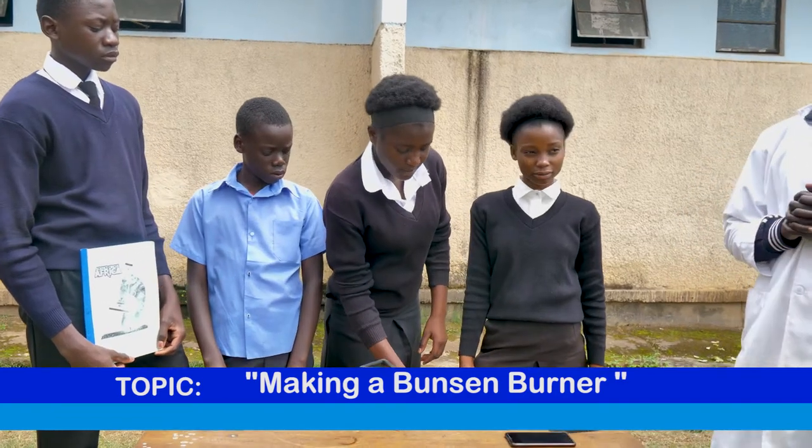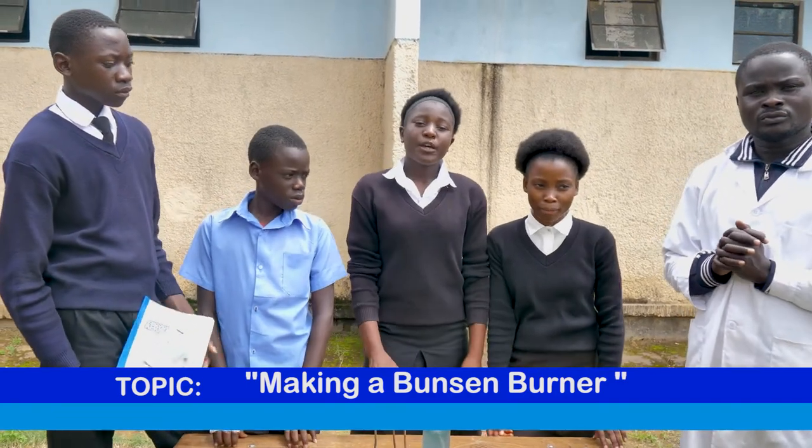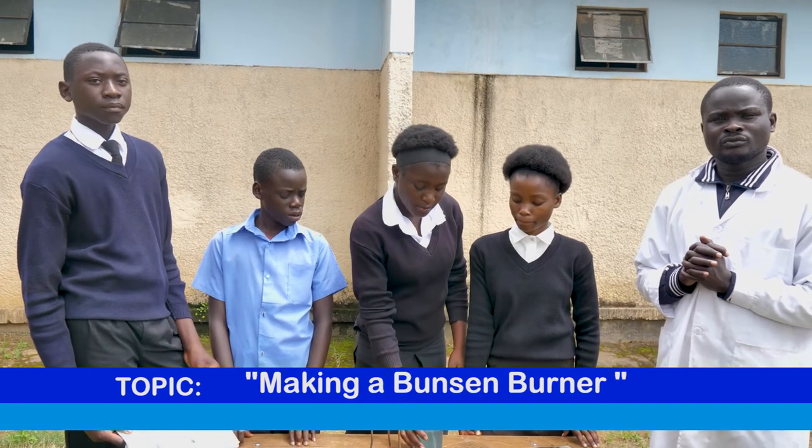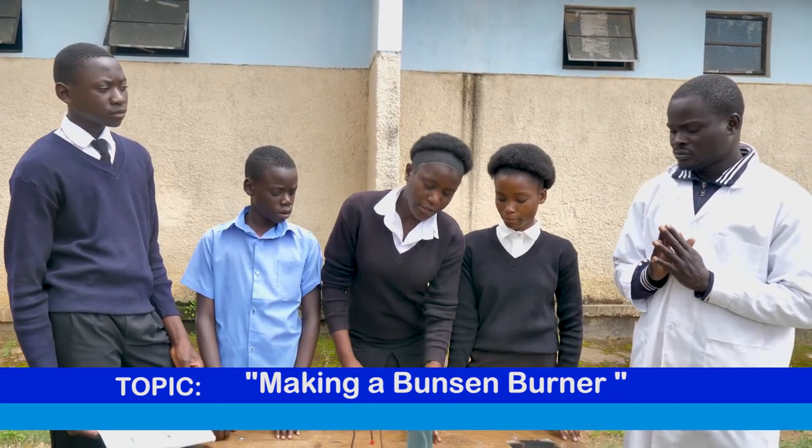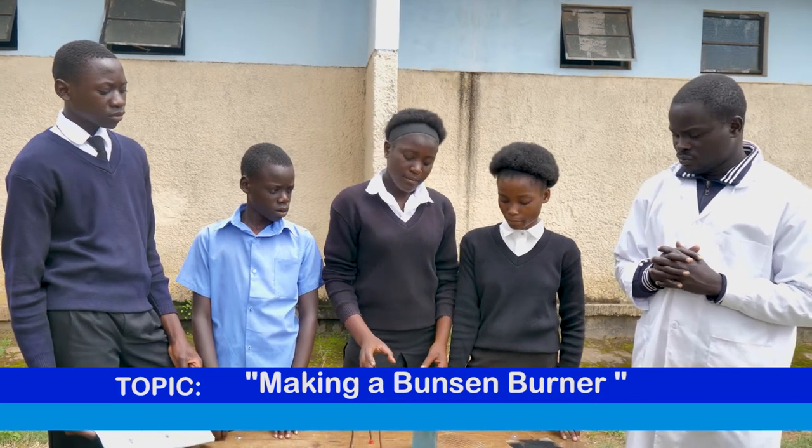This is a Bunsen burner. Our group came up with an idea of making a Bunsen burner with equipment such as a bottle of mayonnaise, kerosene, and a cotton cloth.